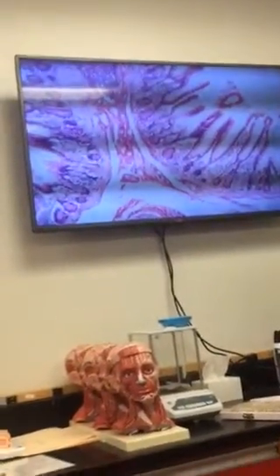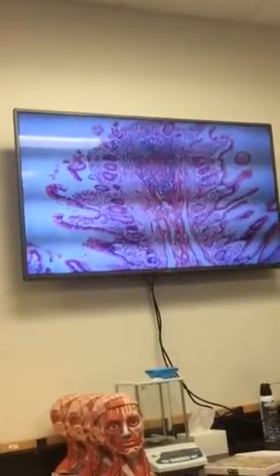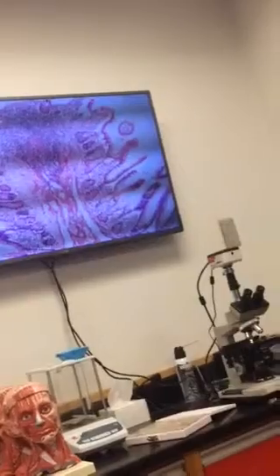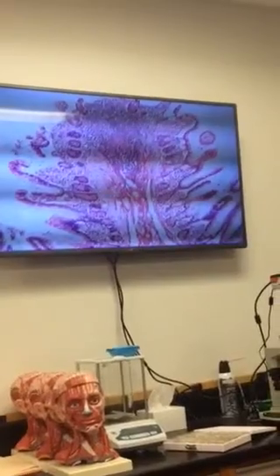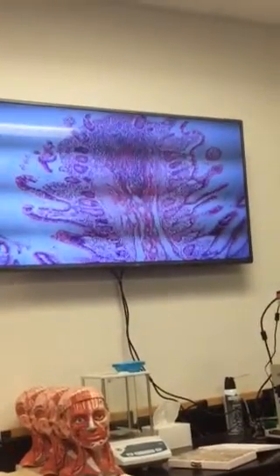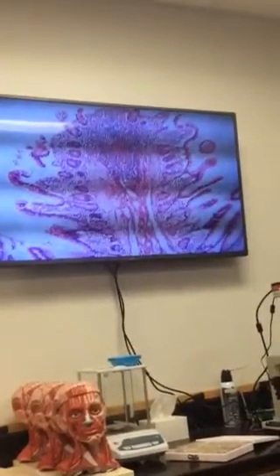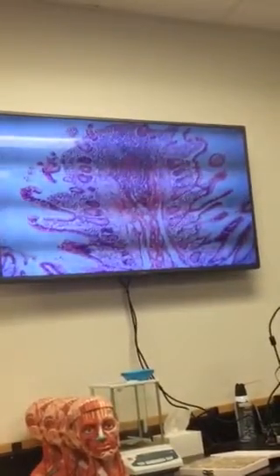And then, by the way, what is that mass of dark staining cells that you see at the top of the plicae? That's part of the mucosa. I can tell you they're lymphocytes, and whenever they're in the ileum like that, that mass embedded in the mucosa, it's MALT tissue, mucosal associated lymphatic tissue, but what do we call it here in the ileum? I'm lost. Uh-oh. A Peyer's patch. Oh. That is a Peyer's patch right there.